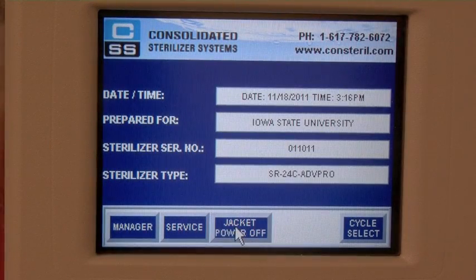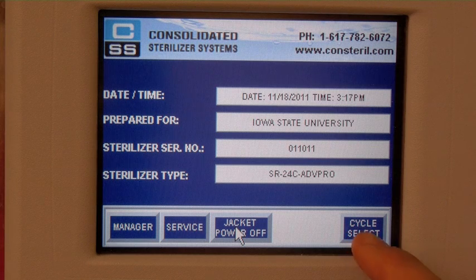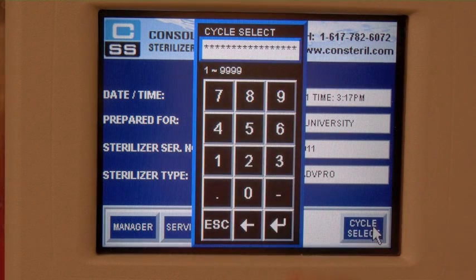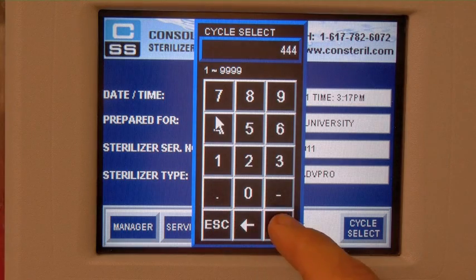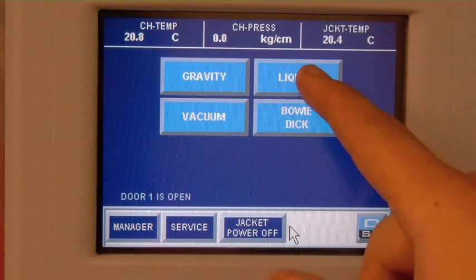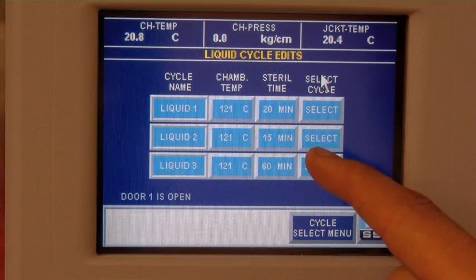On the touchscreen, turn on jacket power. Press select cycle and enter 444 as the user ID. Select autoclave cycle for 45 minutes at 121 degrees Celsius.